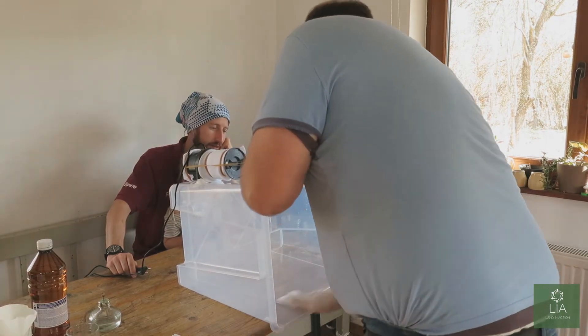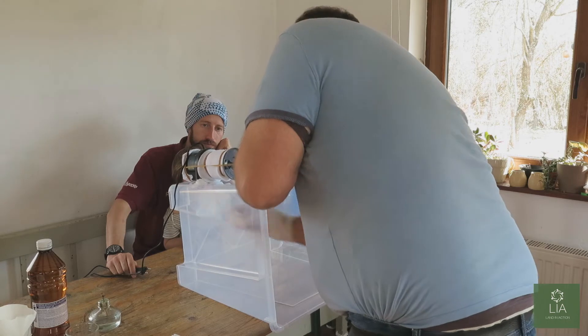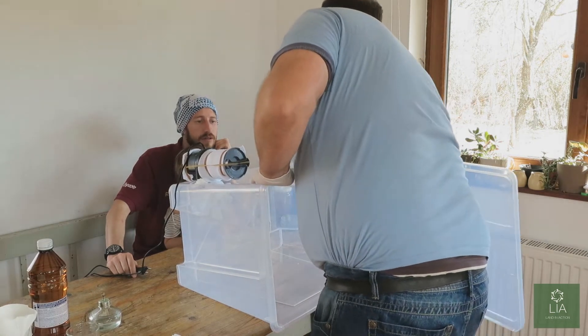Wipe everything. Wipe everything. All you're wanting to do is make sure the alcohol goes on everywhere.